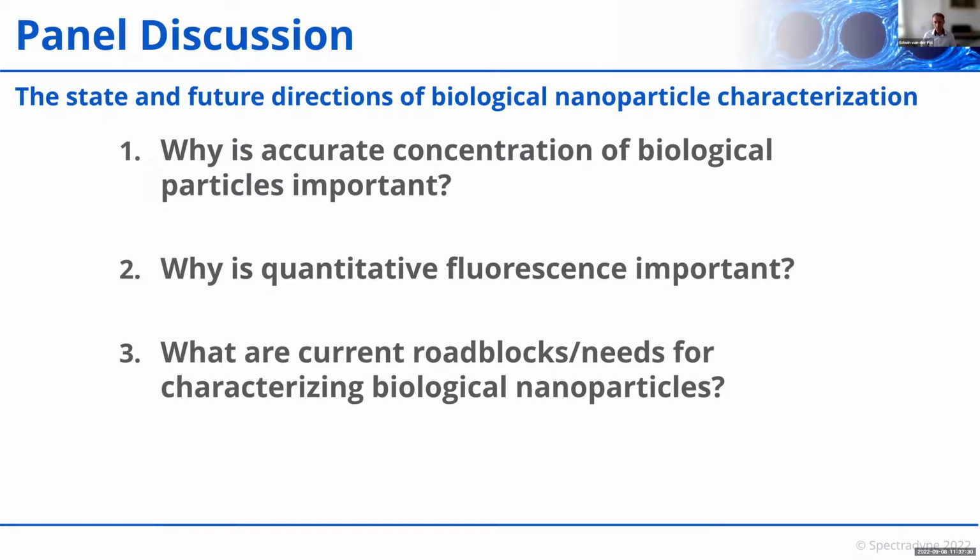Right. I would echo exactly what Edwin was saying, and say that the roadblocks that we face arise from the smallness of the size of these particles and their heterogeneity, and the fact that all of the instruments that we're using began at first as instruments adapted from the larger cellular space. It's only now with dedicated instruments that we're starting to have applied capabilities for these small particles.